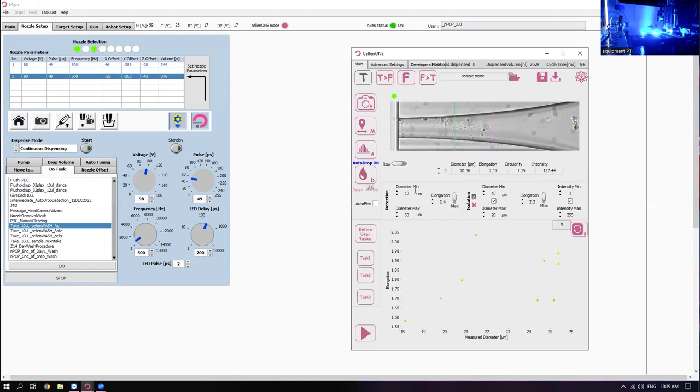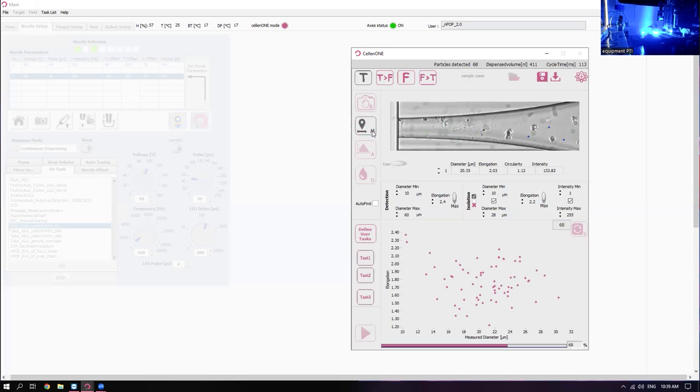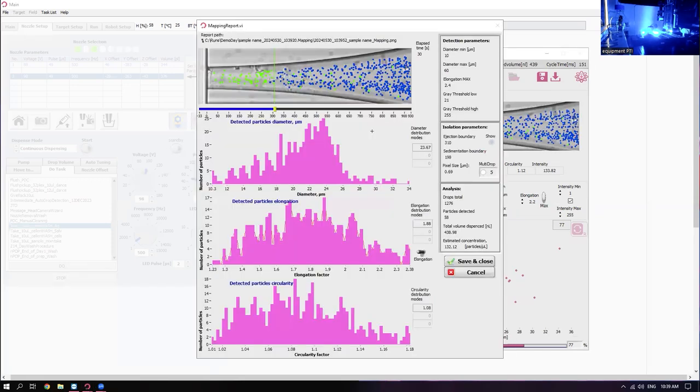And essentially what we'll do is we will do a mapping routine. This is the data that we use to identify where this ejection region is. It gives us this 99%+ single cells in droplets. You can see here the blue dots following each cell, that's where the cell was detected in the last image. Those blue dots will turn to green dots as soon as that cell isn't detected anymore. After accumulating this, I think we're doing 100 particles worth of this tracking process, we're identifying which region here is where the cells aren't seen again. We see that that's a pretty stark contrast here. We have some small particles that we saw in there, but we see a pretty distinct line between these green dots where the cell wasn't seen again and the blue dots where we were tracking it still.